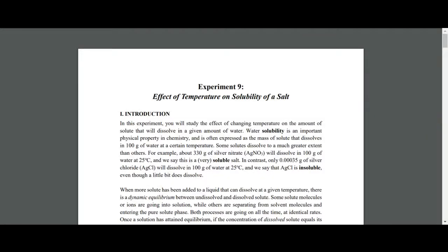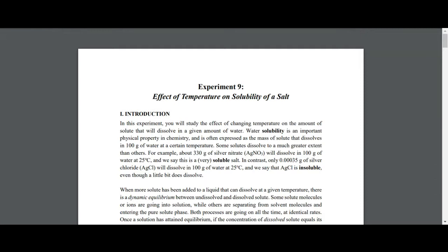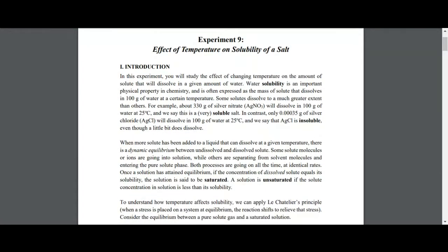Okay, let me go over the experiment first. This experiment is about solubility. What is solubility? Solubility is the mass of the solute that dissolves in 100 grams of water at a certain temperature. So that's the definition for solubility.